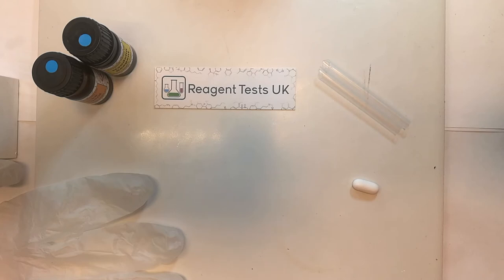Once the reagent tests are diluted, the chemicals are in such a low concentration that they don't pose a threat on skin contact and they can be washed down the sink. It is of course important not to drink the water that you've used for cleaning.